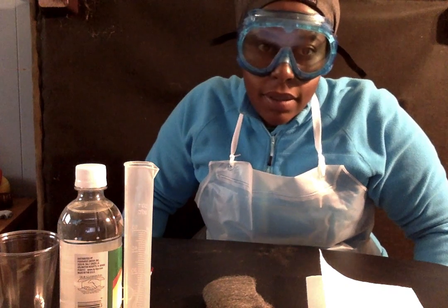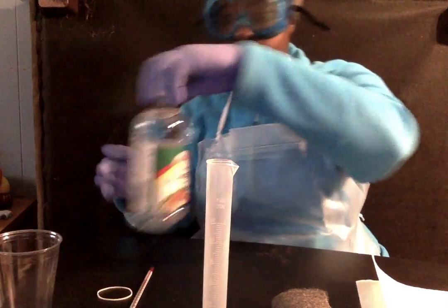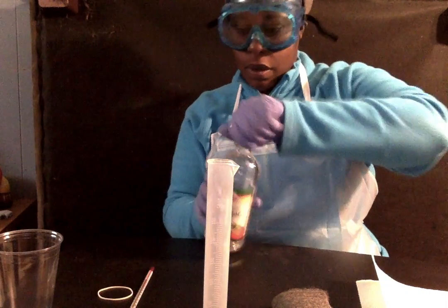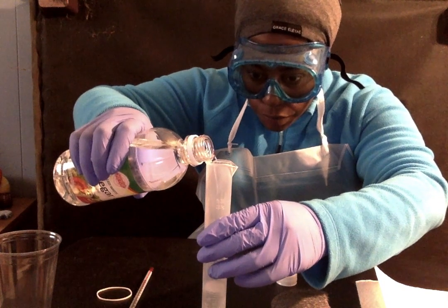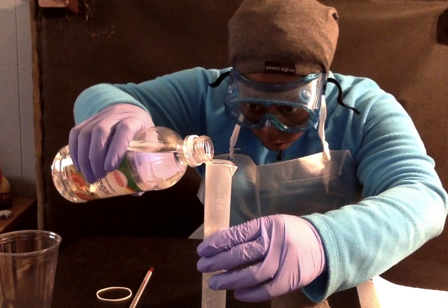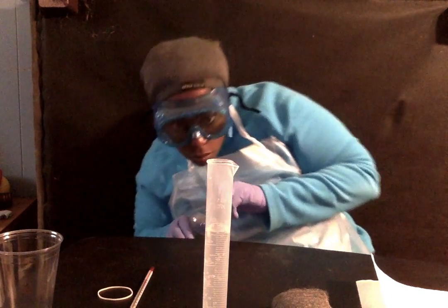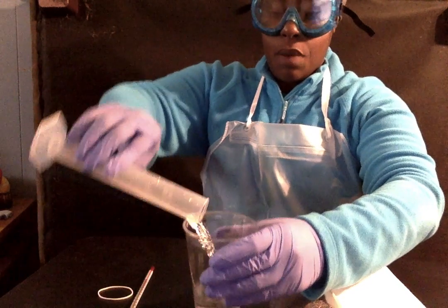Good afternoon, everyone. We're going to be doing activity one, which is synthesis reaction. So the first step is to measure 50 milliliters of white vinegar into a graduated cylinder and then pour it into a small cup. So we have our 50 milliliter graduated cylinder here. We have our distilled white vinegar. 50 milliliters of white vinegar poured into a small cup.